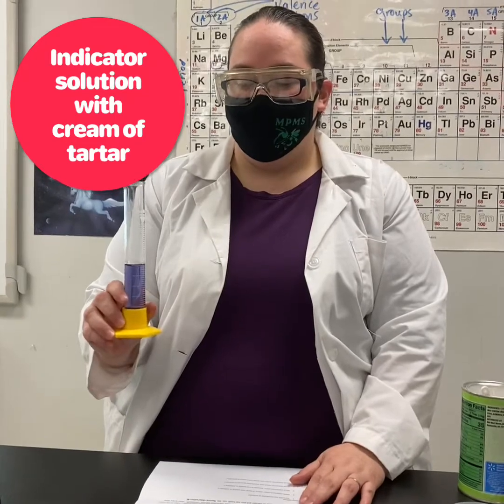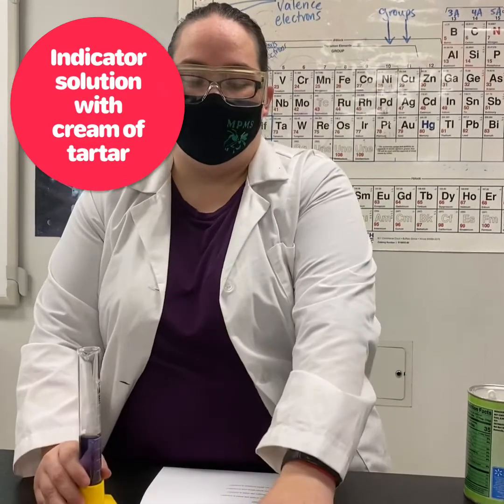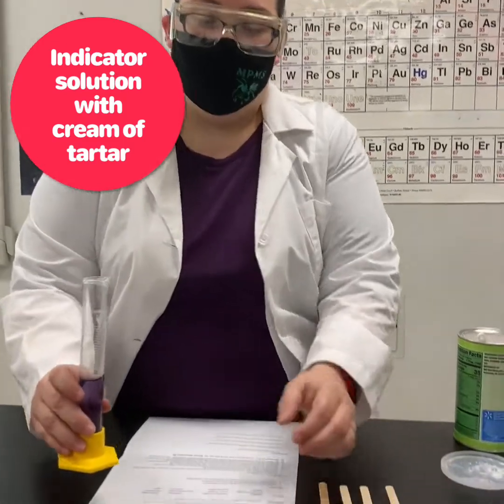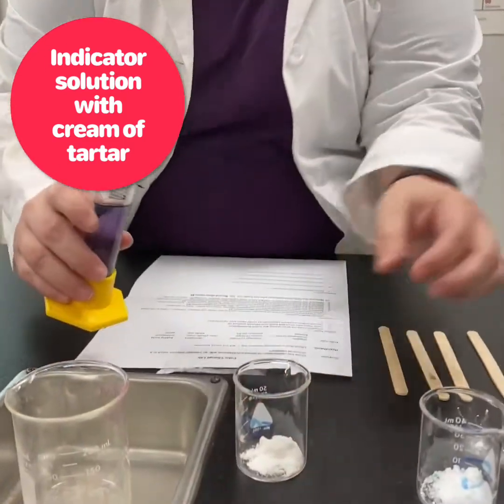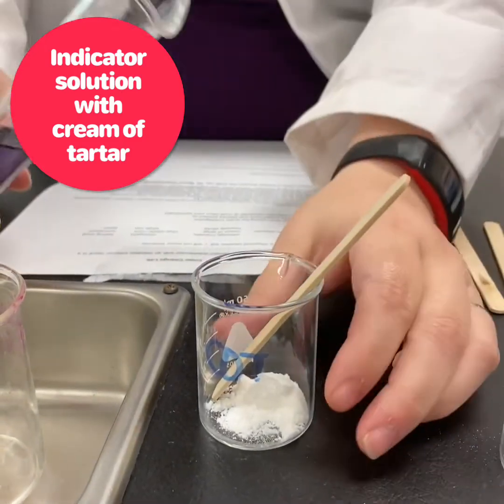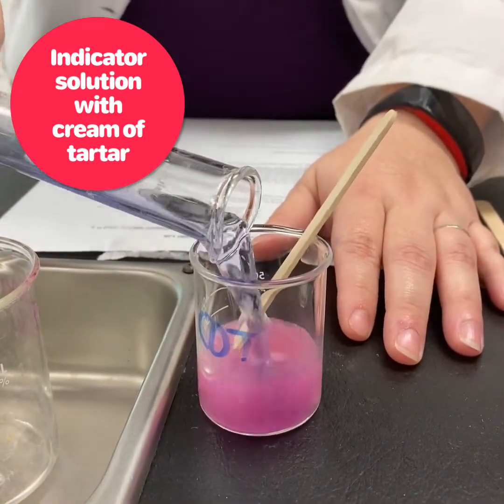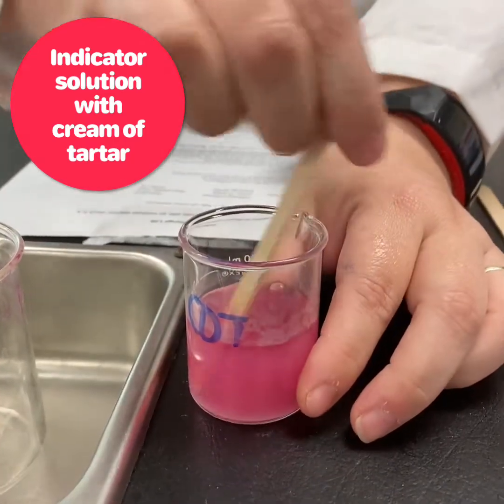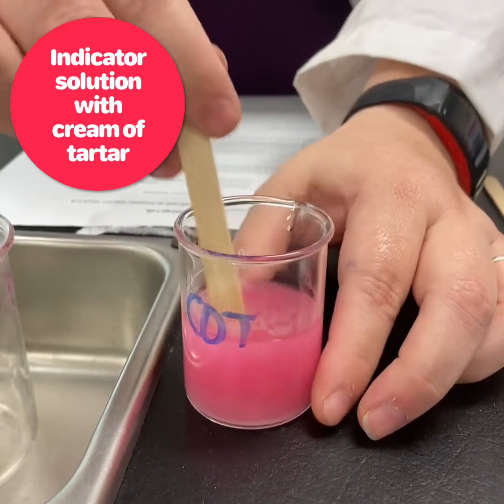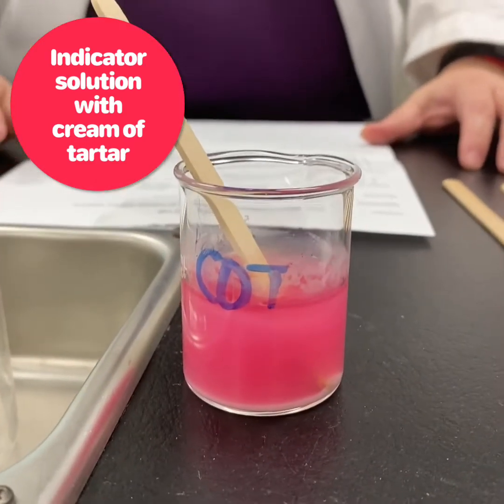Now that we've measured out our 30 milliliters of indicator solution, our next step is to pour the indicator solution into the beakers one at a time, and stir to see if a reaction occurs. We're going to start with our cream of tartar. I'm going to put a popsicle stick in, and we're going to use that for stirring. Right now it's a white powder. Stirring, stirring. As you can see, our white powder with the indicator solution turned into a bright neon pink.